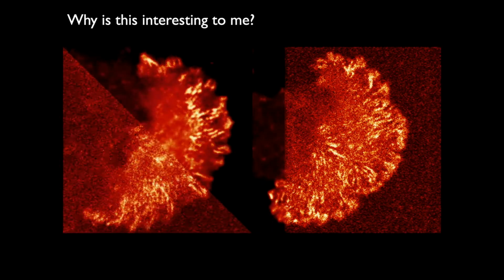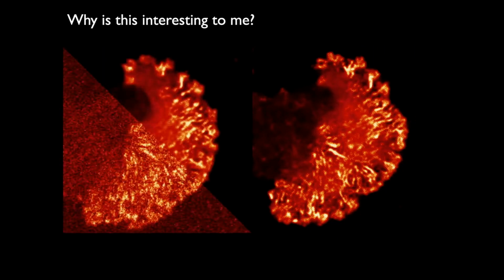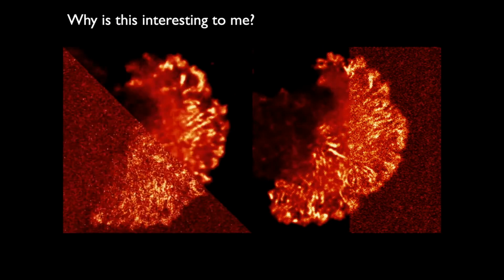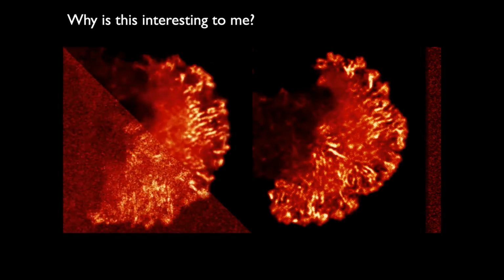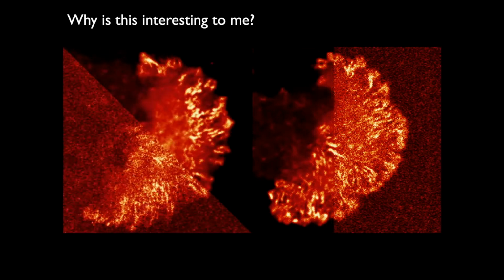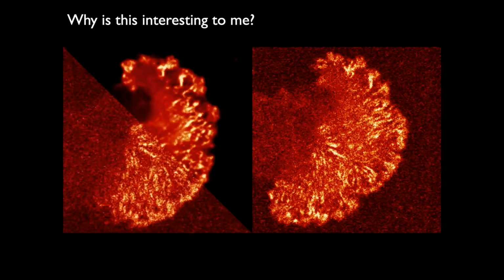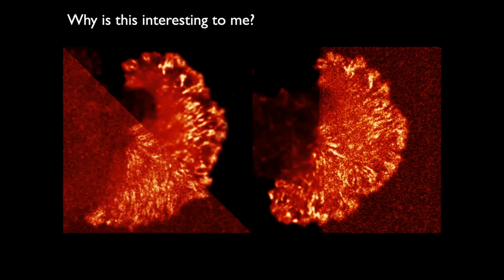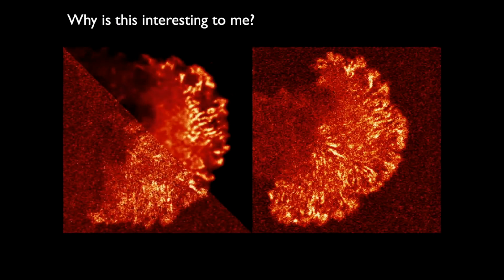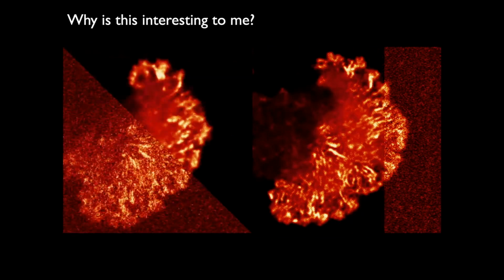So one of the reasons why I personally became really interested in deep learning was because in recent years, we quickly realized that for denoising, machine learning is beating any other previous algorithm we've ever developed. And because we work on super resolution, and particularly live-cell super resolution, acquiring data at low illumination is really important for us to really be able to follow biological processes for long periods of time. So this opens the door for us to image for much longer, relying heavily on the denoising to then get back the data that we want. So this is what got me interested in machine learning.